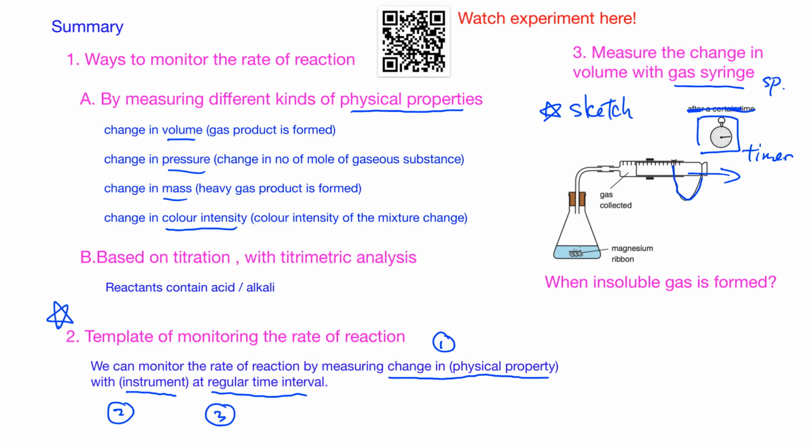So when do we use it? When an insoluble gas is formed. So when an insoluble gas is formed, we're going to use this one. Just now you learned that hydrogen and nitrogen are insoluble gases. Those are suitable for using this setup to help.